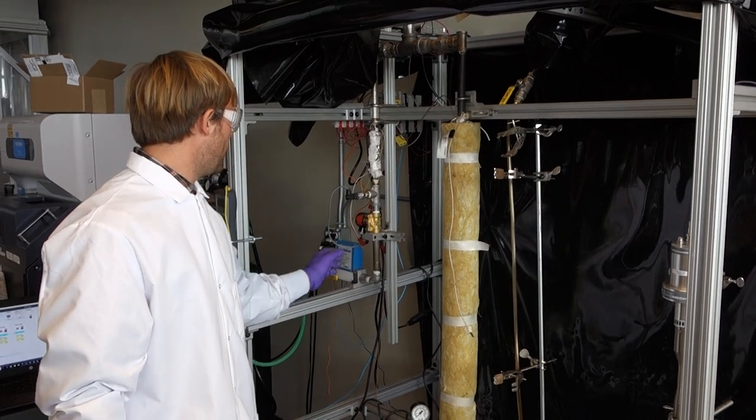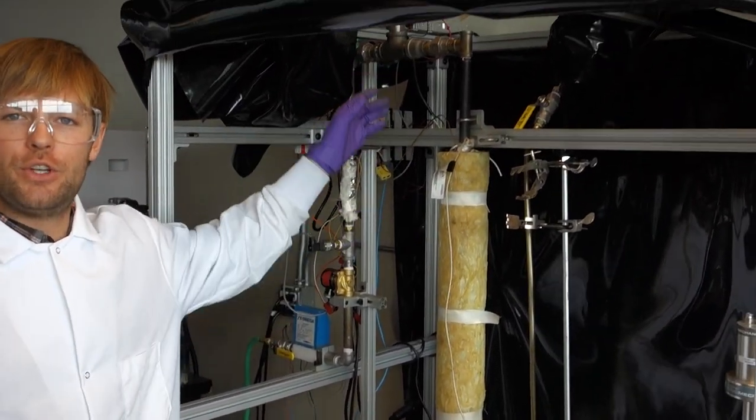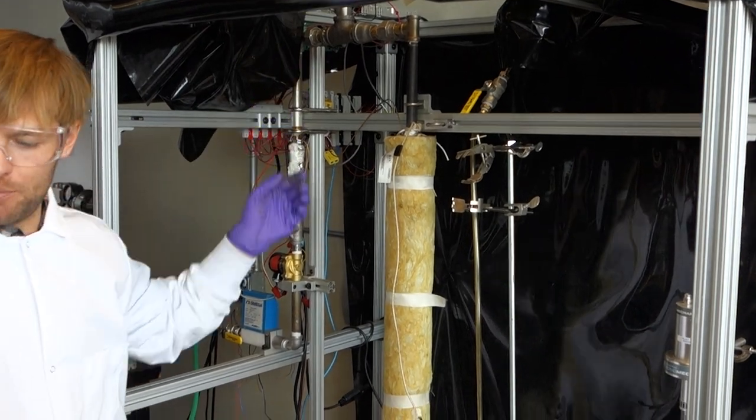If you look here, these are devices that control the flow of nitrogen gas, which carries biomass.